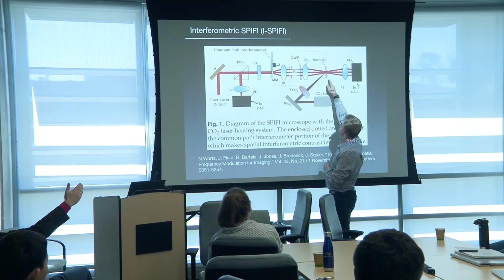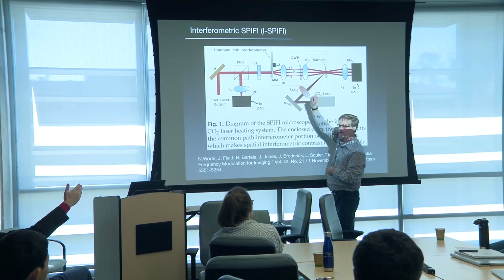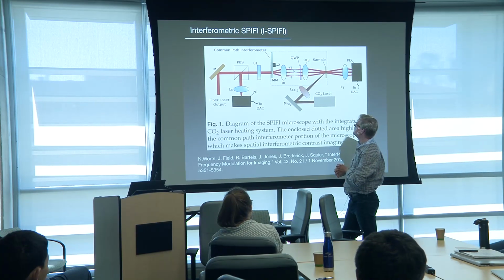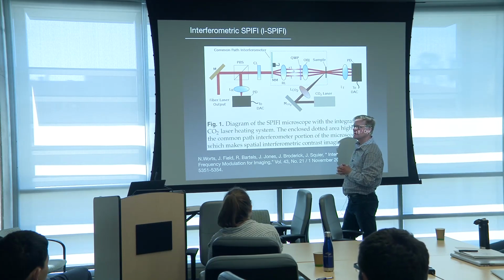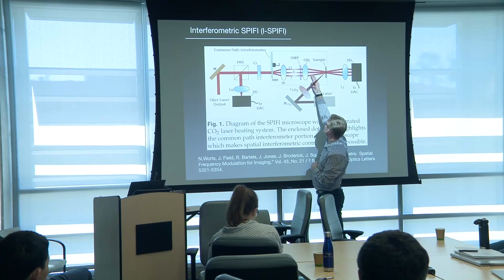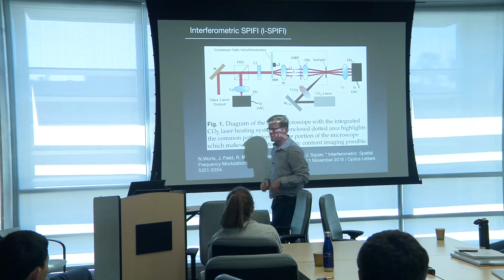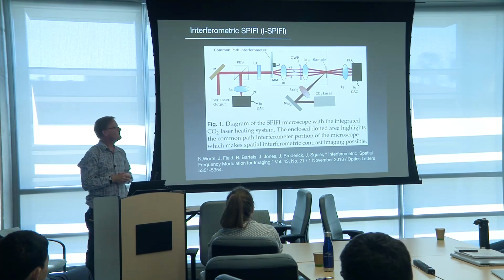So you're saying I'm reflecting back, so you have phase modulation in here or something? Would you see it? I would say probably, yeah. Okay. So it's aggregated phase fluctuation from the objective to the sample. If it happens outside of the 0th order beam, it'll manifest itself anywhere on that path. Yeah.